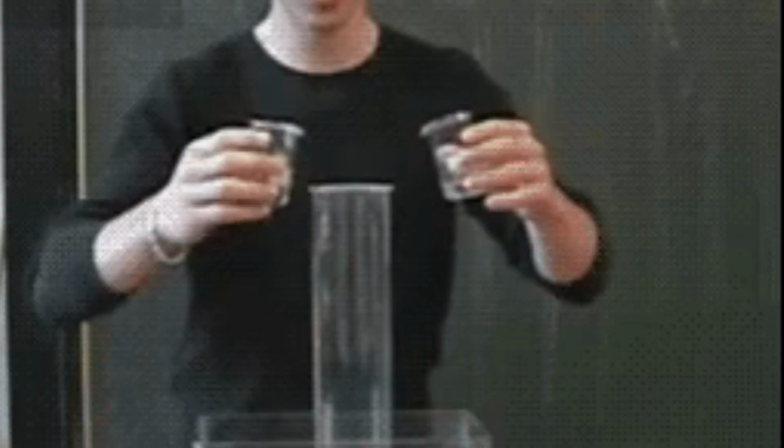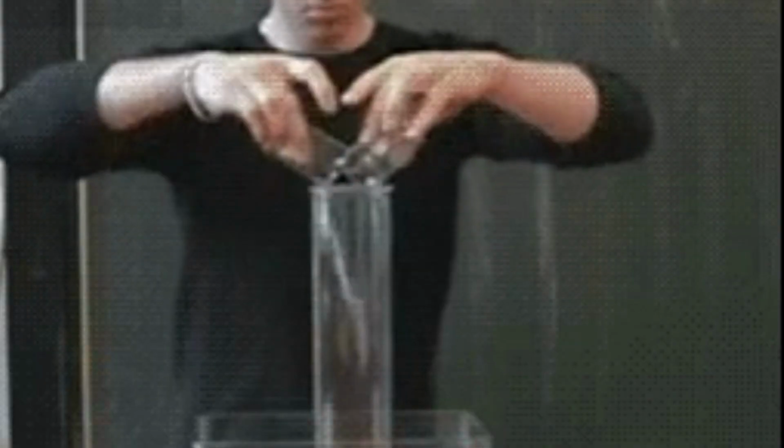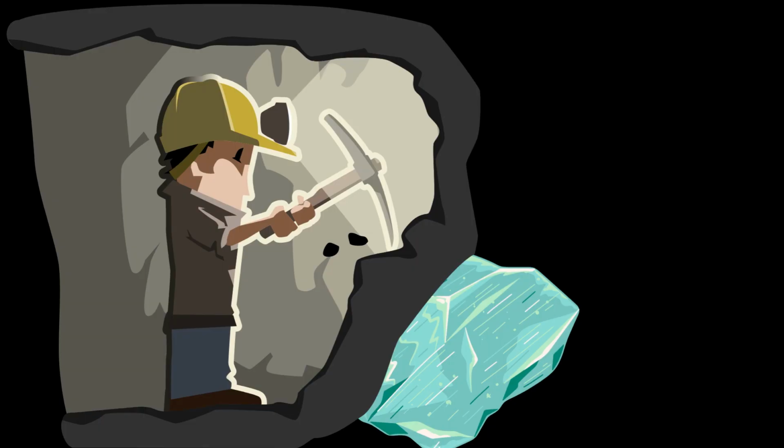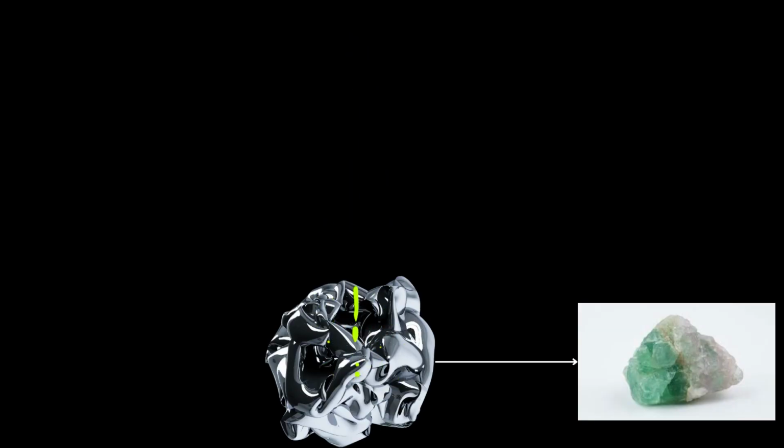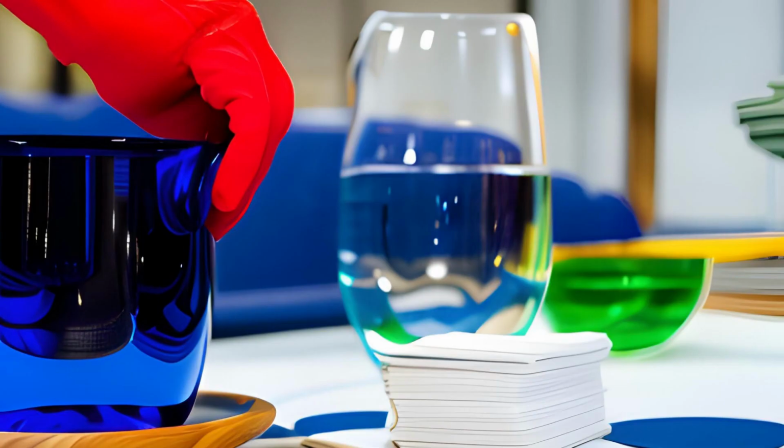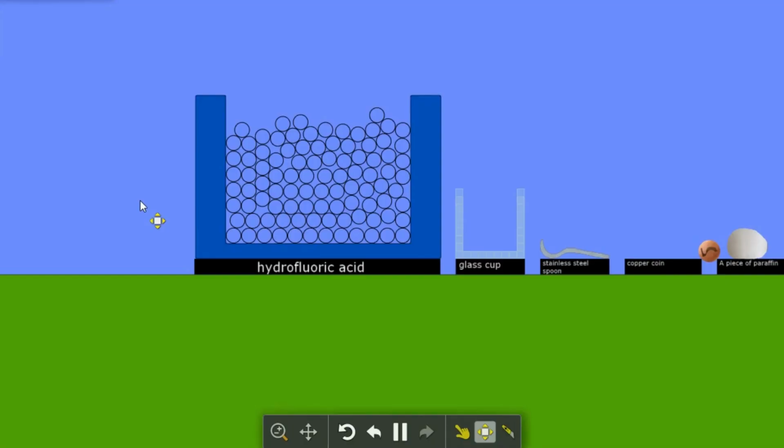Hello. Today we will do an interesting experiment with hydrofluoric acid, which is known for its ability to corrode glass and other silicates. Hydrofluoric acid is an aqueous solution of hydrogen fluoride, HF, that is obtained from the mineral fluorite. It is a medium-strength acid that reacts with many metals to form fluorides. But the most interesting thing is how it interacts with silicon oxide, SiO2, which is the basis of glass and other silicates. Let's see what happens if we put various objects made of glass and other materials into hydrofluoric acid.